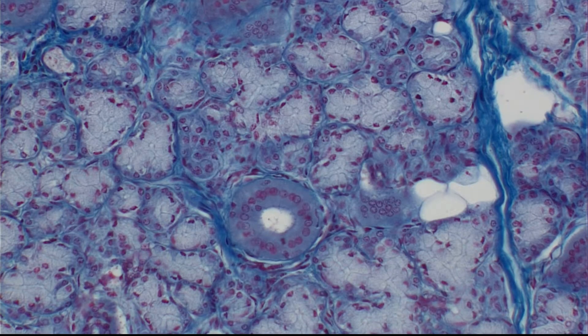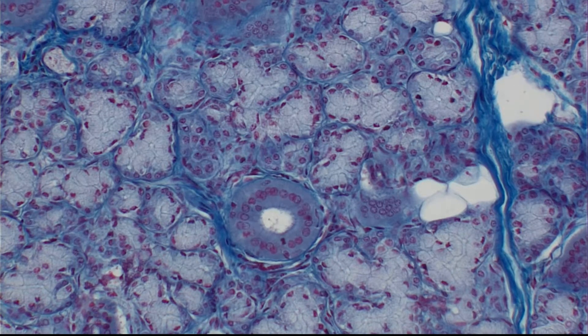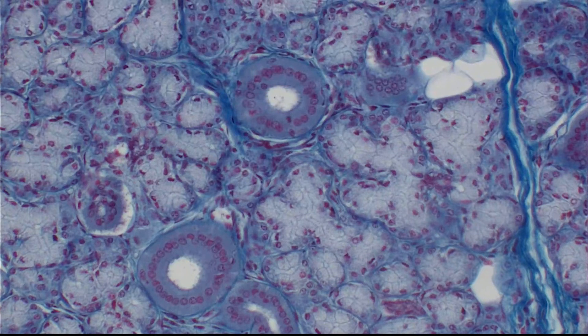If we change magnifications to a lower power and a larger field of view, the image is crisp and the transfer of data is fast.